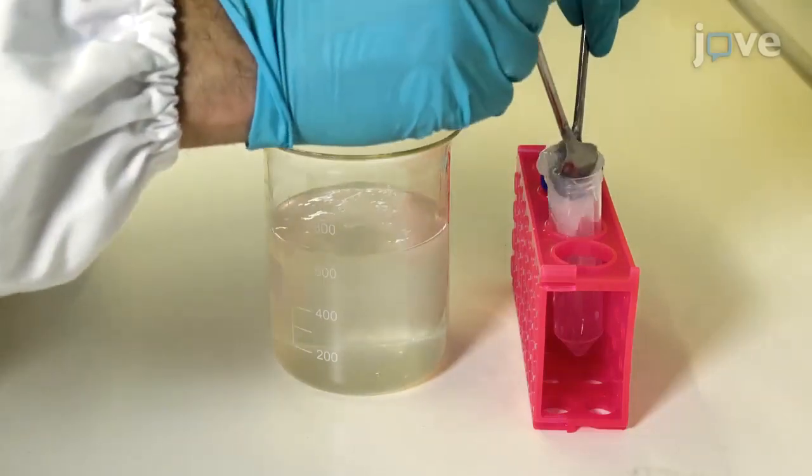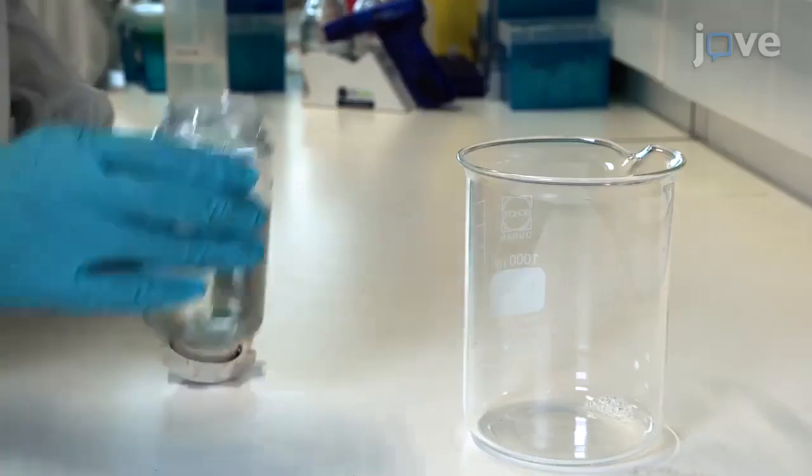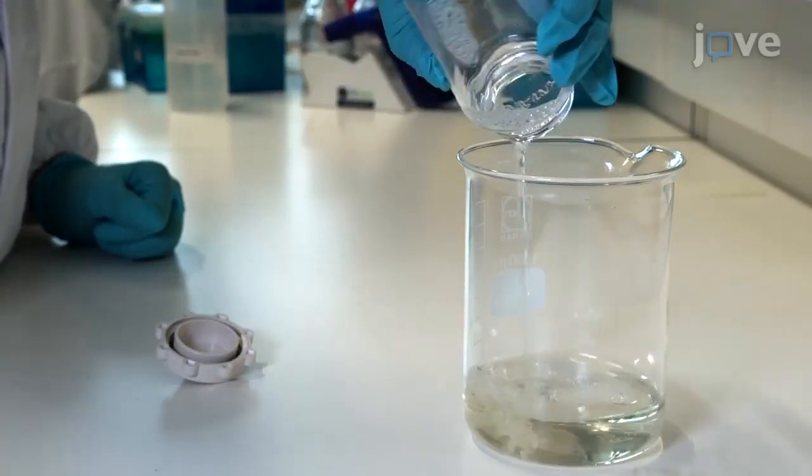These protocols are very straightforward. They can be tailored according to the producing organism, the user needs, and the final application of the product. The main advantage of these protocols is that they can easily be adapted to other living systems, in particular to other bacteria. These protocols are easy, however, one may need to introduce some changes depending on the bacterial strain or the degree of purity required.